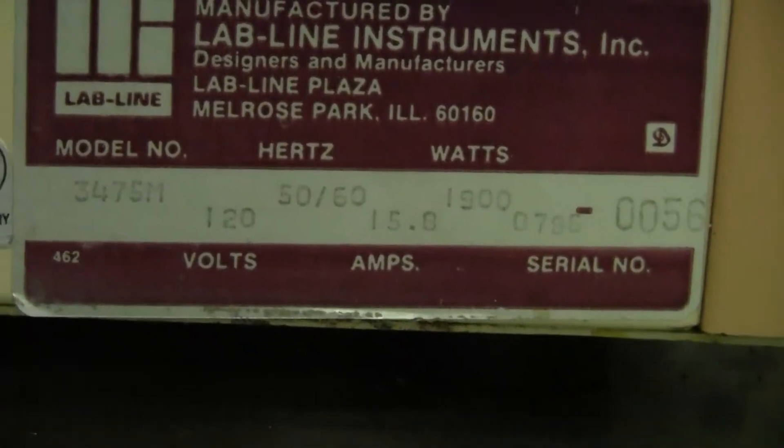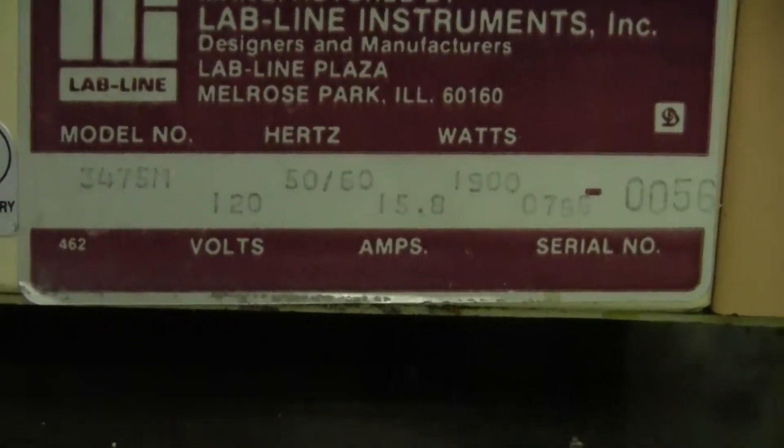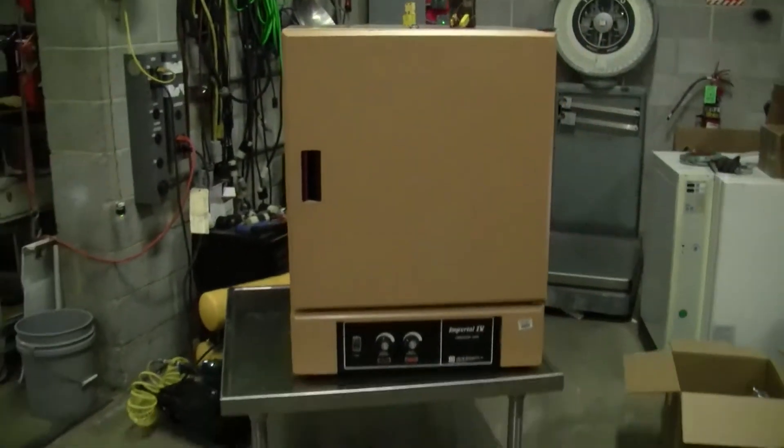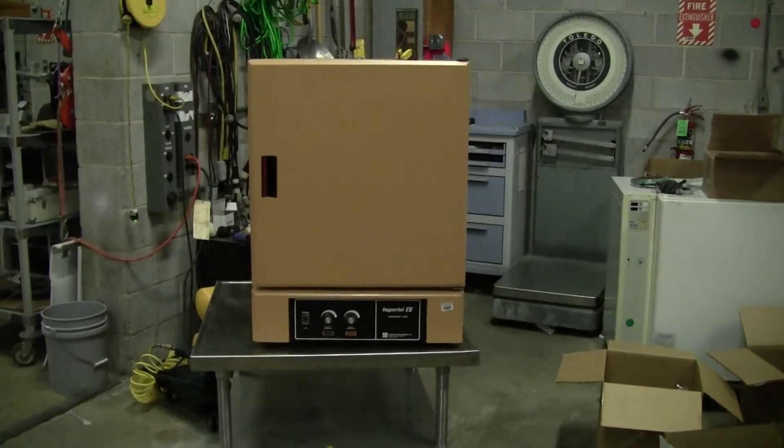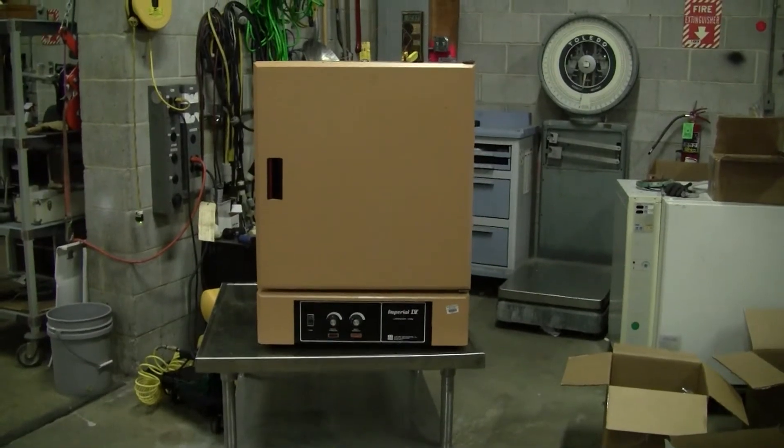The model number, the wattage, the volts. If you have any further questions on this unit, please don't hesitate to call — area code 609-518-9100. Thank you again from HitechTrader.com.